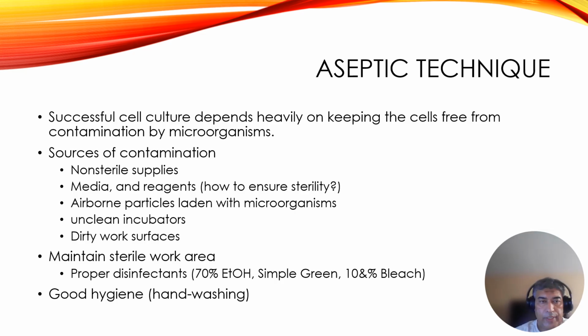To maintain a sterile work area, we need to properly disinfect the area with 70% ethanol, Simple Green, or 10% bleach if we are working with contagious viruses like HIV. Also, follow good hygiene, with good hand washing before and after working in the biosafety cabinet.